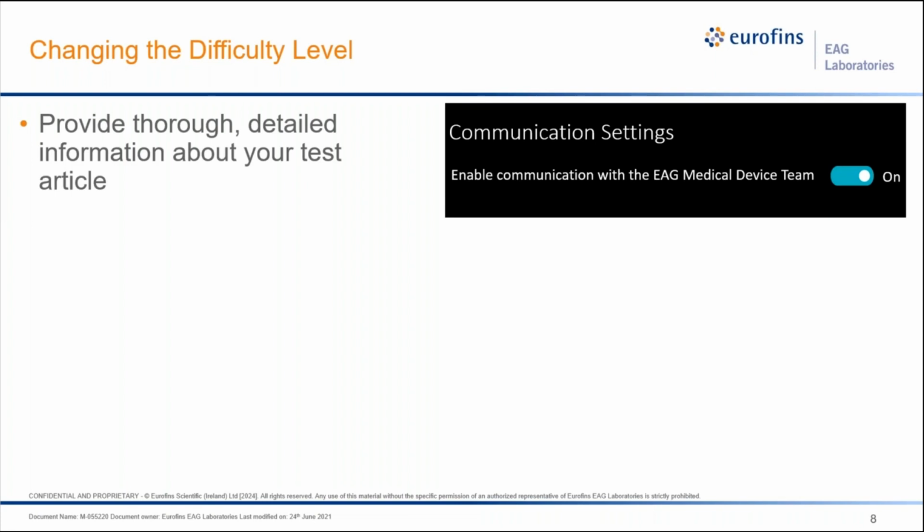So what kind of information do we need? It's anything that answers the following questions. What are the components of the device made of? Are they nylon, PTFE, or silicone, or something else? How do you know they're pure? Quality control documents or certificates of analysis can shed light on sources of impurities or contamination.